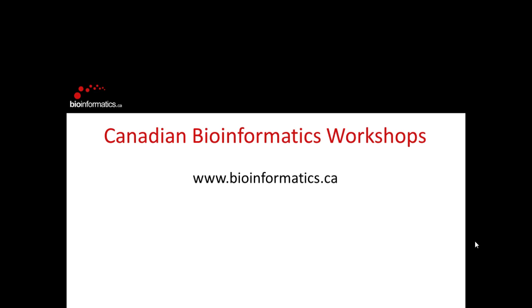Microarrays are a really good technology to talk about because they're probably the only omics technology where we actually sort of know what we're doing. I mean, it's fair to say, and you've seen the rest of the course, that there's a lot of lack of clarity, imprecision, about how you might analyze different types of data. In microarrays, there are some clear things that we can say are right and are wrong, some things that we know work well and some things that we don't. There's obviously still opportunities to improve the way we do our analysis, but it's reasonably worked out.